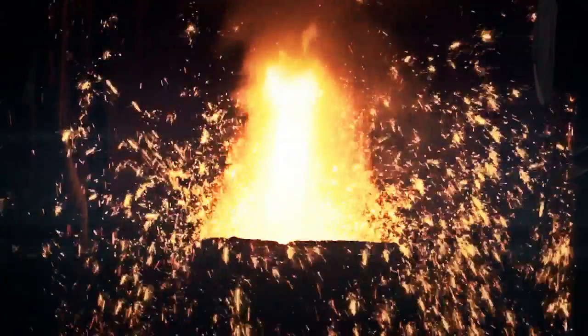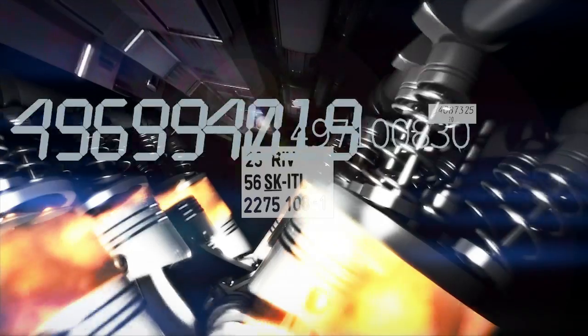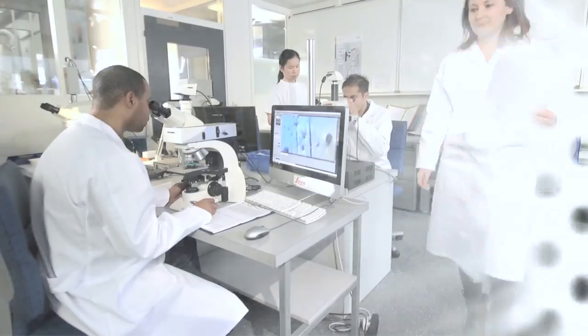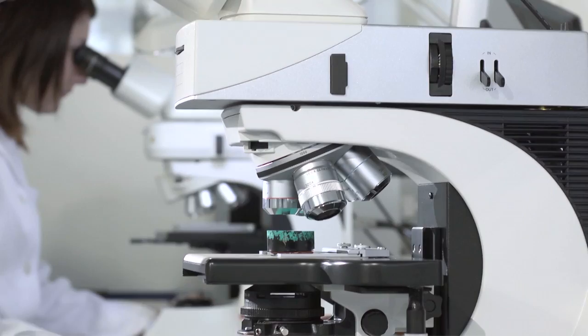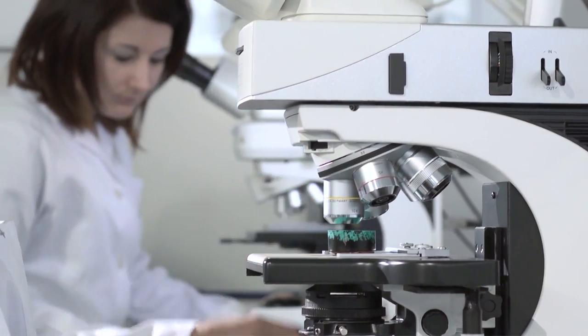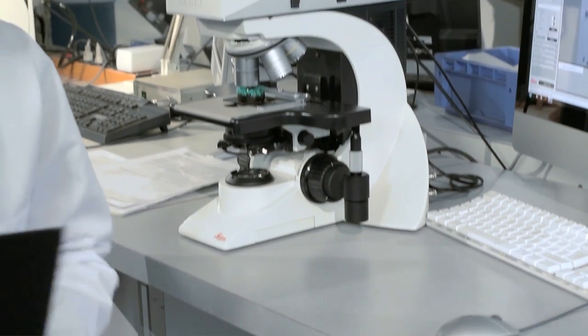Materials need to meet higher standards and you need to ensure that quality specifications are met. Therefore, one step in the production process has become very important: material testing with Leica Microsystems. Accuracy, reproducibility, and efficiency. The Leica DM2700M.